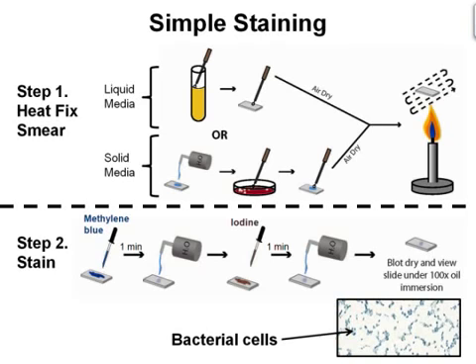Examine the slide under the bright field microscope. Viewing under 100x with oil immersion will give you the best view of your bacteria, as shown here on the bottom right. This is because the oil used has the same refractive index as glass. Record the shape, arrangement, and approximate size of the organisms.